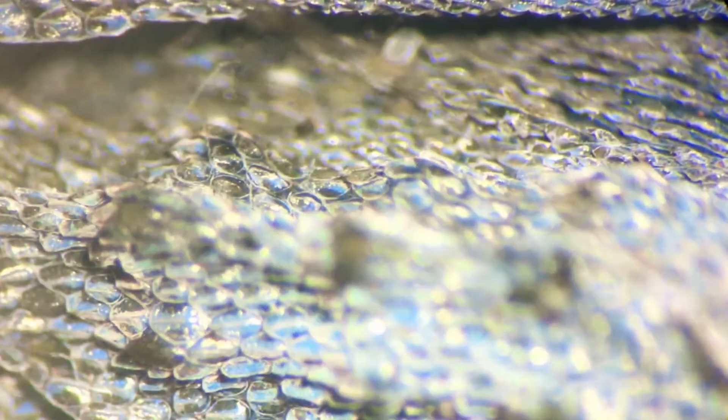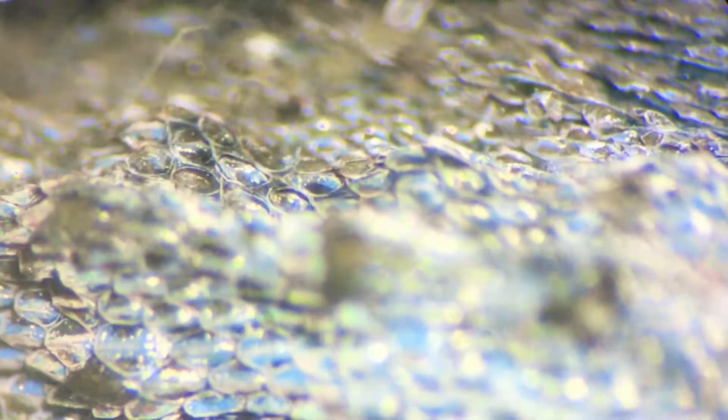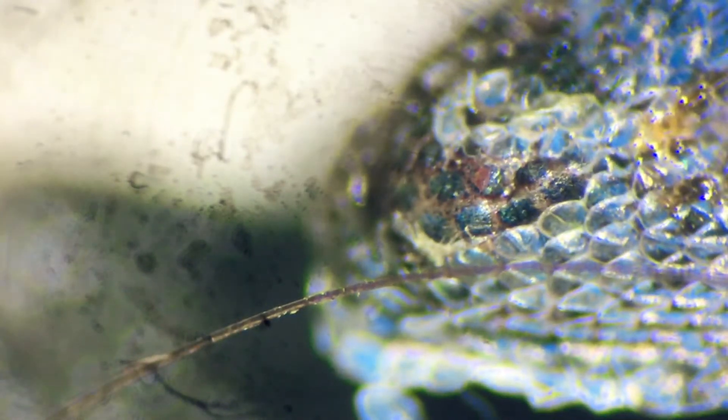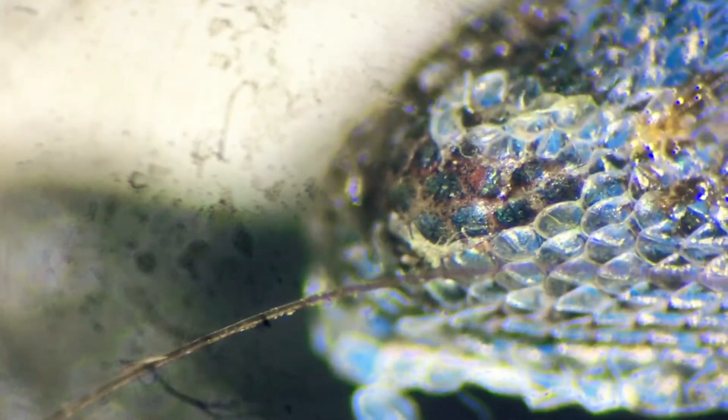Yeah, there you go. What are we looking at here? Oh, his arm. Is that — it's not a hair — oh man, I think that's one of my hairs on top of the lizard. Oh, that's cool.